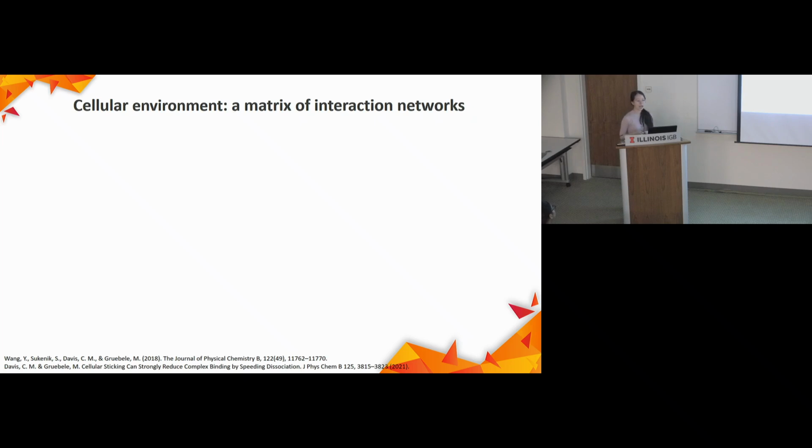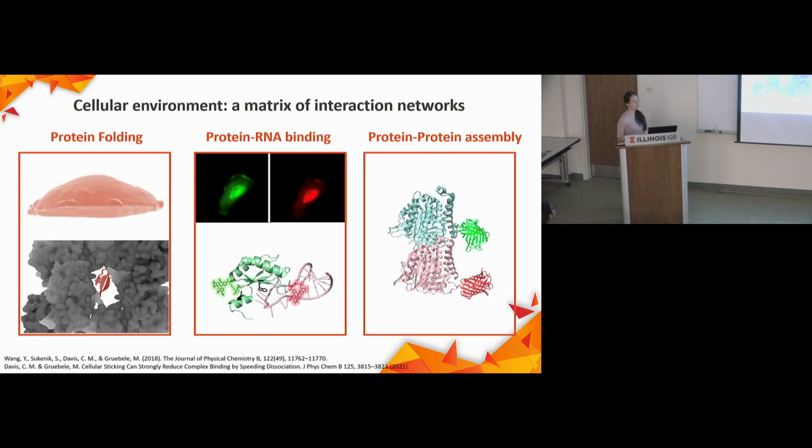So our group has studied protein folding in the living cell, protein-RNA binding in the living cell, protein-protein assembly in the living cell. And all these studies are done on the ensemble level. So it will be extremely cool if we can study this protein behavior on a single molecule level. And MINFLUX makes it come true.